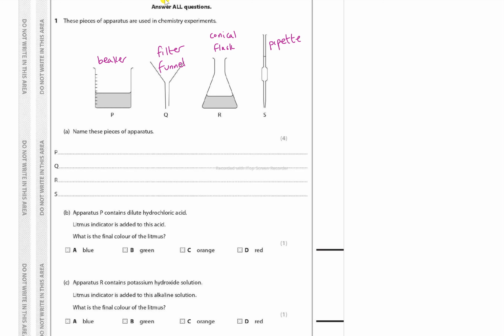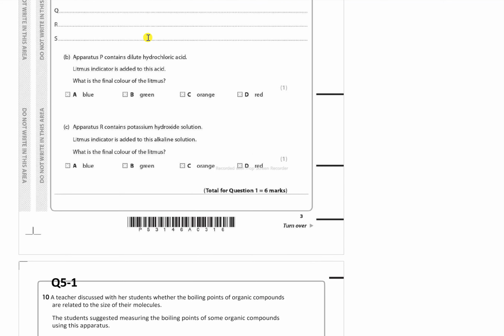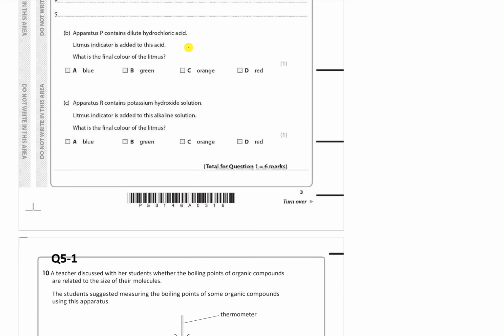Right, normally on top of this you have a little bulb, and you squeeze this, and then that draws up, and you can see there's a little marker there. So for example, if you wanted 25, I don't know, centimeter cubed or 5 centimeter cubed or whatever it was, you'd get that. It'd have a little marker on it, a graduation mark, and you'd fill it to there. Right. Litmus paper.